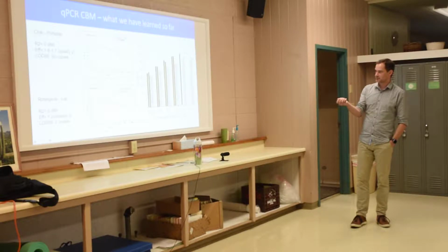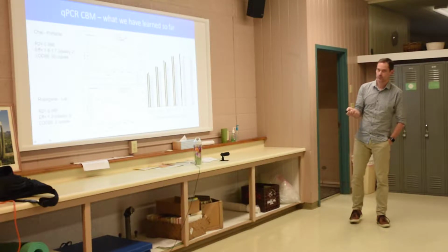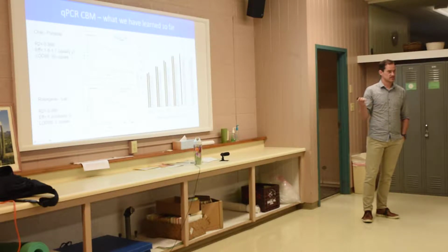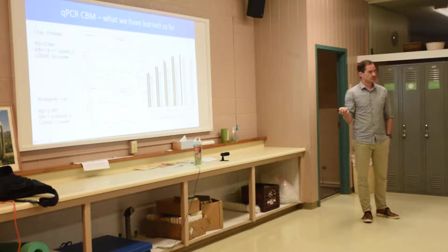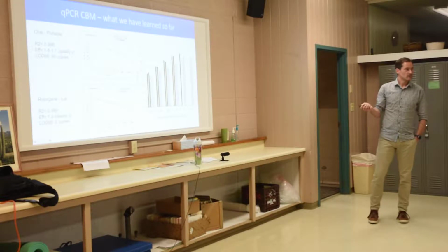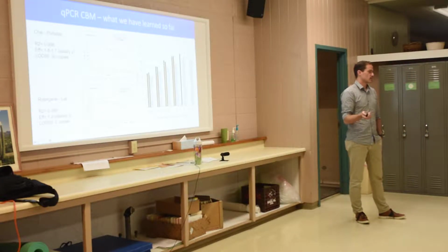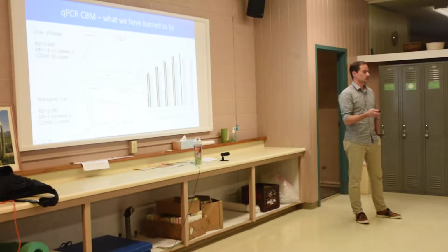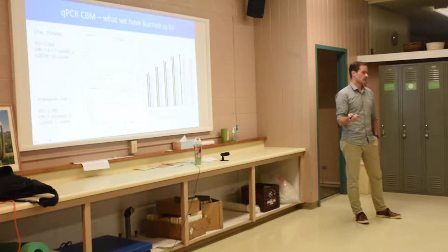And that's actually better than the Rotor-Gene, which gives us 0.985. Both of those are fine. The point, though, is that the Chai performs just as well as the core machine. It's just less sensitive. And that means that if this is the number of gene copy numbers that you were trying to detect, the Chai kind of falls off when you get down into this really low number. For something like an enteric bacteria study, that's not a problem, because if you only have 5 or 50 copies of Enterococcus, you're never going to do a source tracking test on that and figure out what's in there, because that's way too low to do a source tracking test.